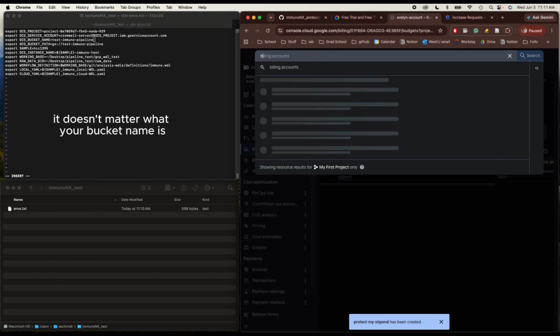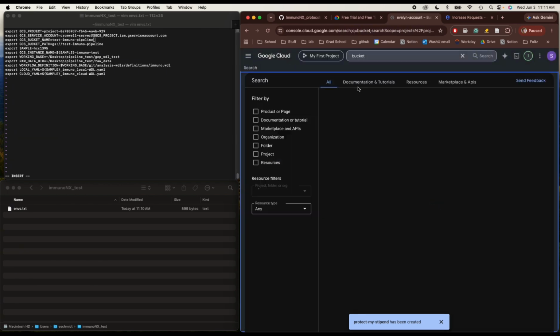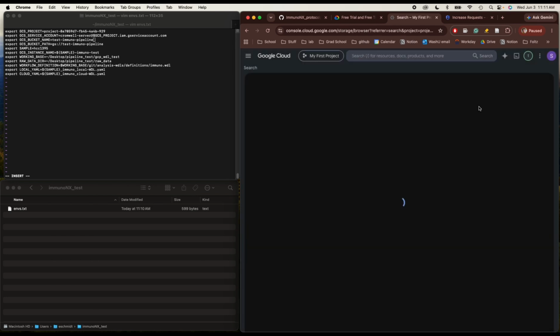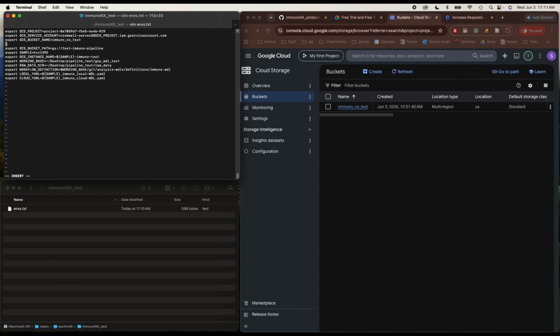Okay, let's go back to our bucket. This one. Okay. It's ImmunoNX test.